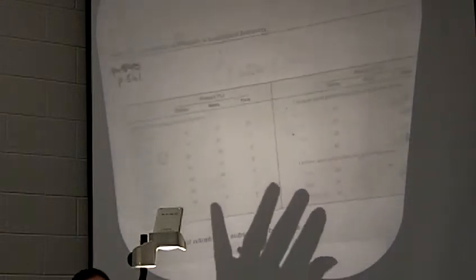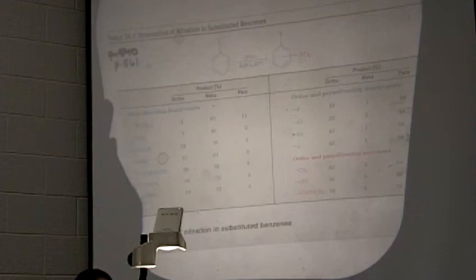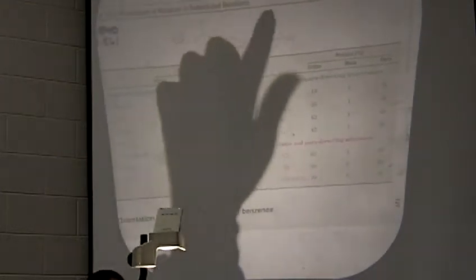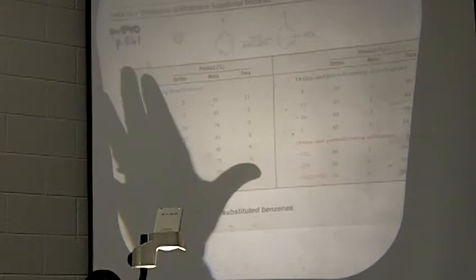And so our aromatic ring is going to be the toluene. The reason for this, and you're going to go through all of these tables when you talk about aromatic substitutions in the lecture, okay? The piece that is important to us is this part here of this table, which is in McMurry, all right?